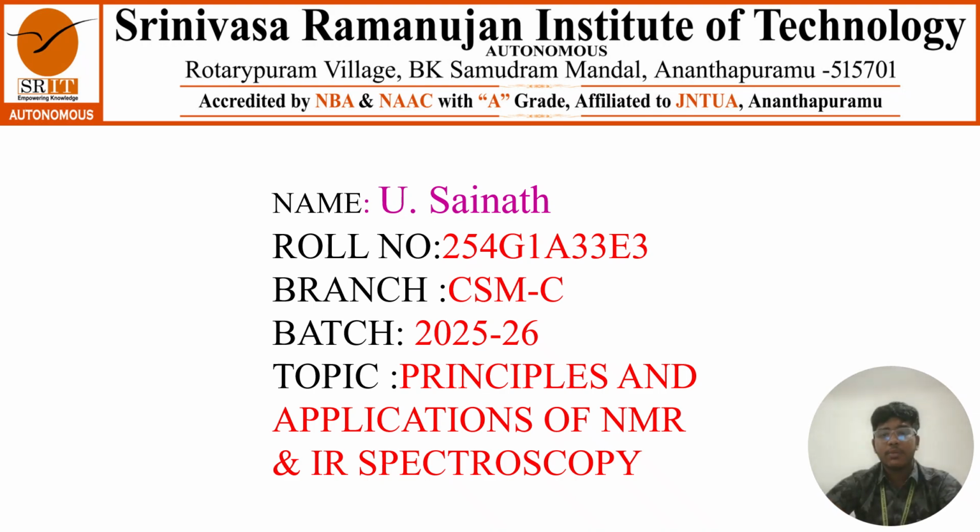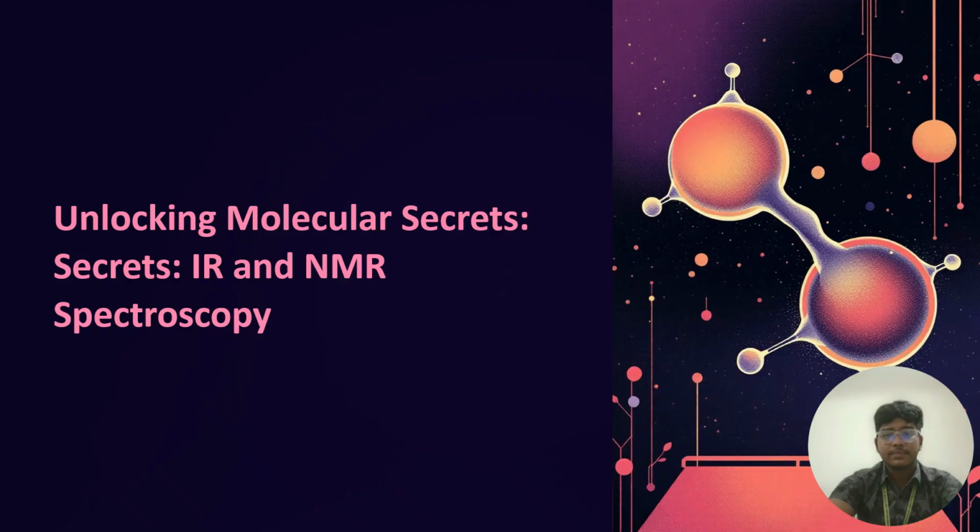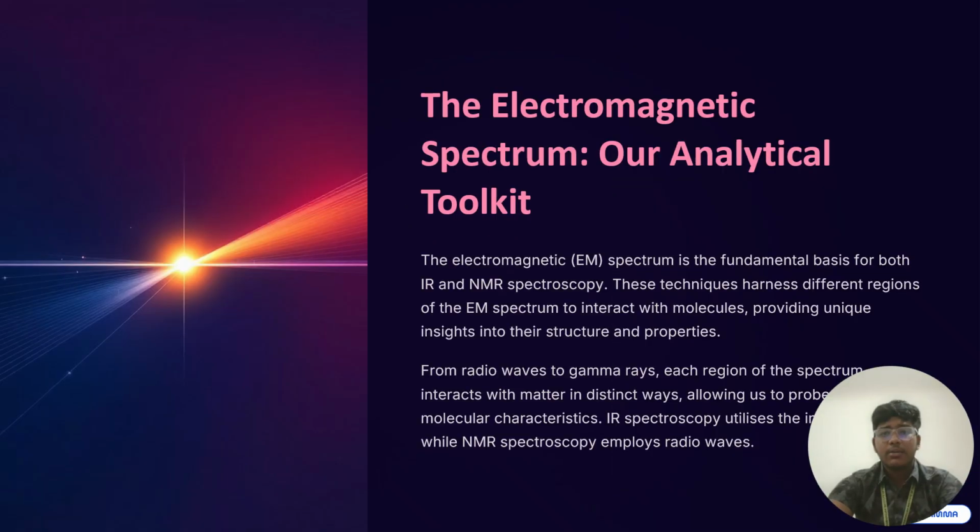Now I am explaining about principles and applications of NMR and IR spectroscopy. Unlocking molecular secrets, IR and NMR spectroscopy. The electromagnetic spectrum, our analytical toolkit.